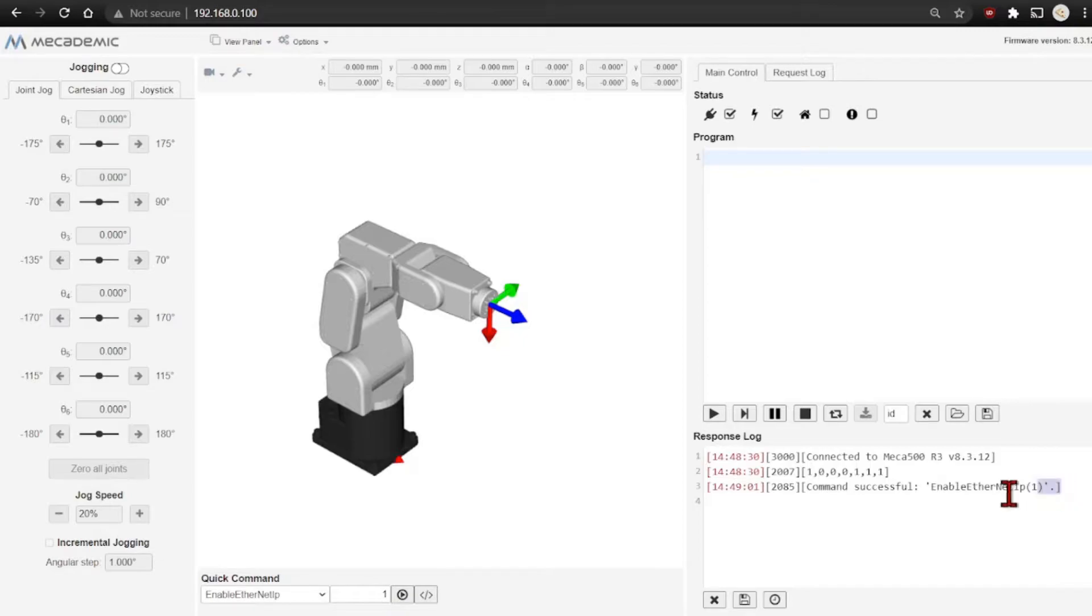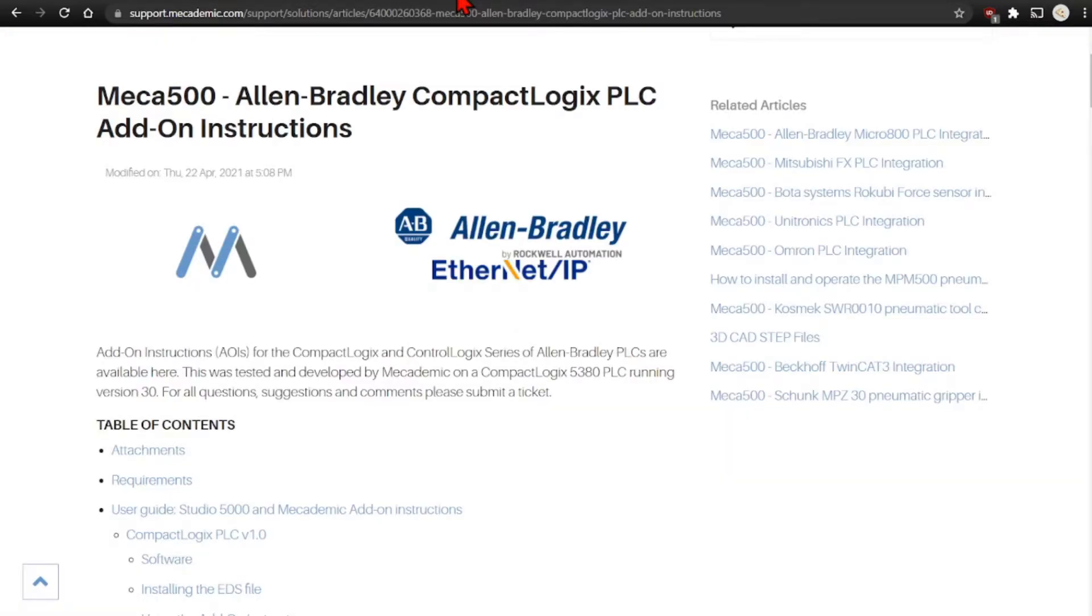If successful, you'll see the response here. Finally, MECADEMIC has provided an example Studio 5000 program with AOIs that can be exported to your program for easy setup.